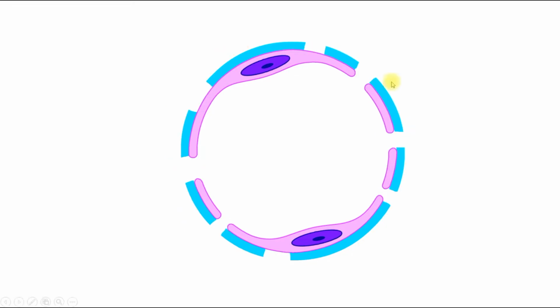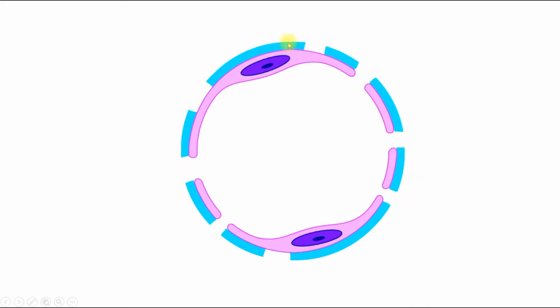And the third type of capillaries is shown here. Let's compare it to this one. So what has been changed? Here we can see that this type has gaps in the basement membrane. The basement membrane is incomplete, as well as the endothelium. There are huge gaps between endothelial cells and gaps inside the endothelial cells. This type of capillary is called sinusoidal type. It has the highest permeability among all three types.